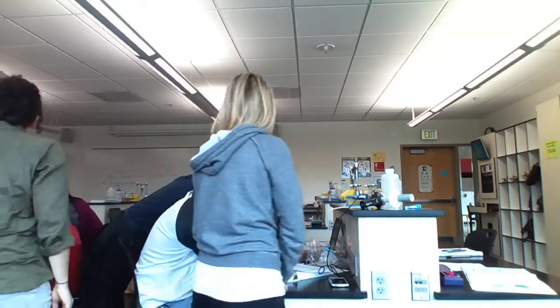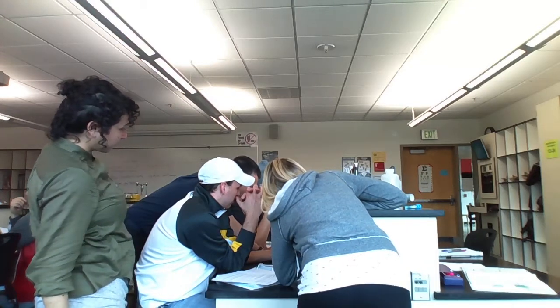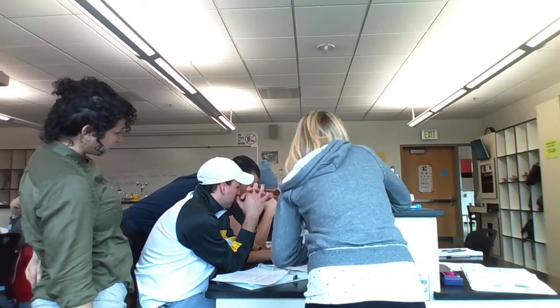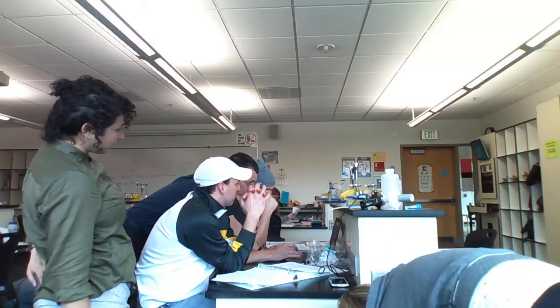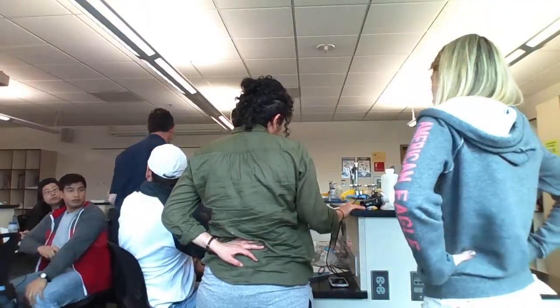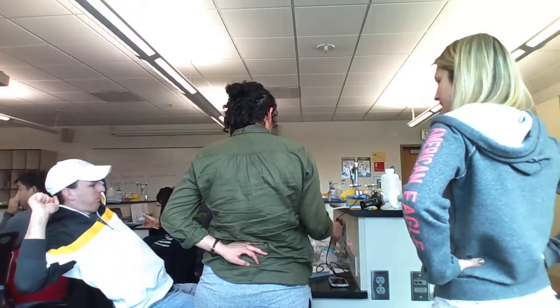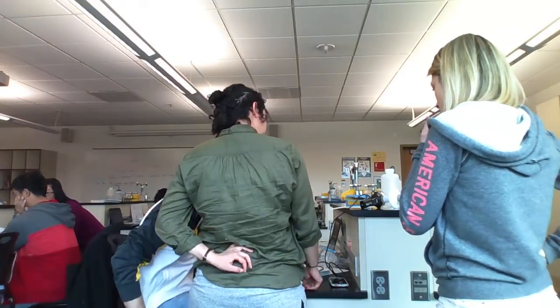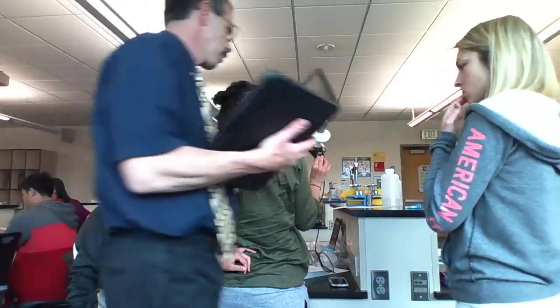Yeah, it's like you're converting it to volume, but it's looking at the flow rate. Very strange. I do not know why your machine is doing that. I would change machines. Let's try the other machine. Let me get you another two. That one for some reason, is it out? I don't know, it's reading it in the wrong way.